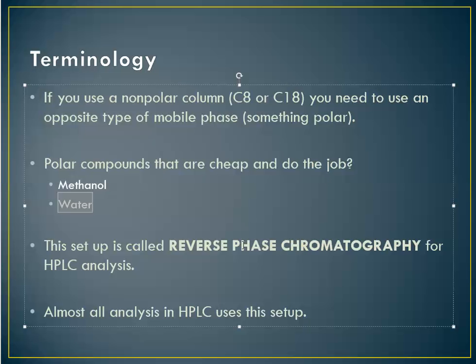So, hopefully I've not bored you too much. Hopefully you've learned something from the theory of general chromatography. And now we need to go in and talk about the instrument pieces and parts. So that's what you'll see in the next set of videos. It will be the HPLC instrument that we have in our lab, and we're going to go through and talk about the pieces and parts of the equipment and why it works the way that it does and why it's there. Finally, after the pieces and parts, we will then look at software. We'll walk you through the software because it is fairly complicated, and we'll show you some of the screens and some of the options that you need to be aware of when you run a sample. So that's what's coming up.